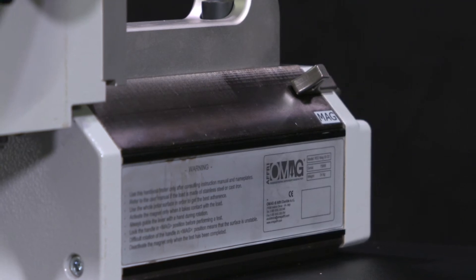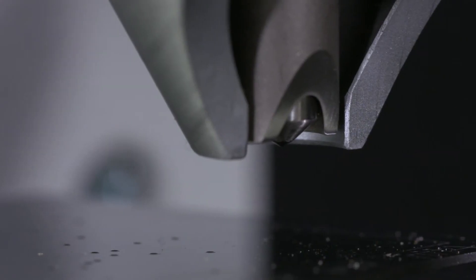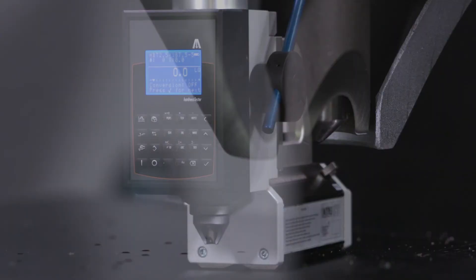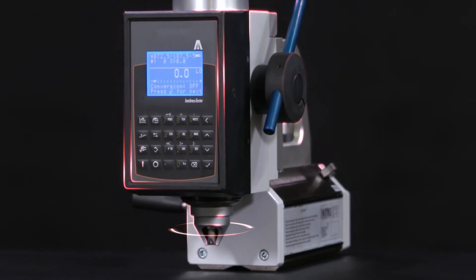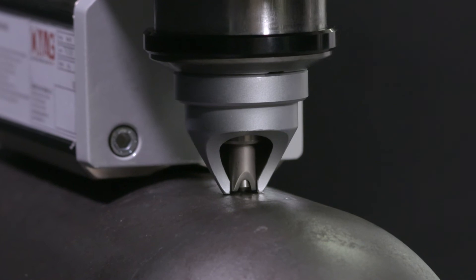The RSD-MAG is equipped with dynamometric load cell technology, which ensures outstanding accuracy in all testing conditions.